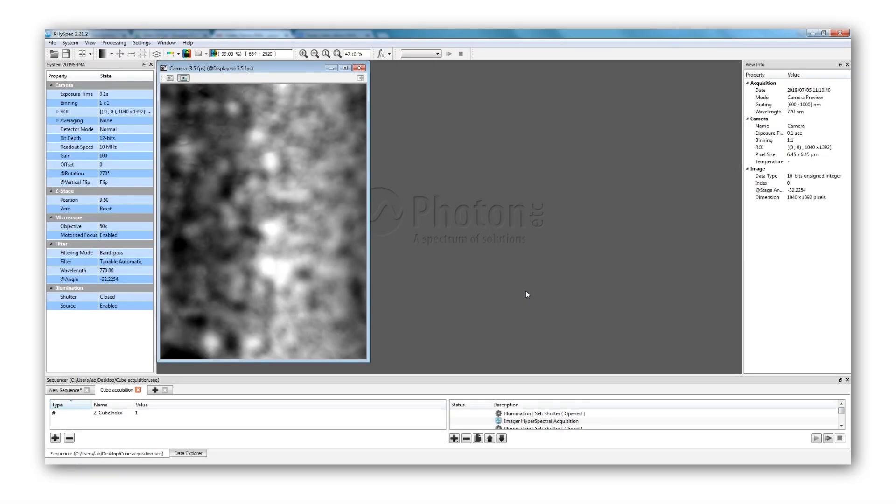Here is the FiSpec interface. On the left, you can find all the parameters of the experiment — first, the camera parameters such as exposure time, binning, and the possibility to average images. It is also possible to control the distance between the microscope and the sample, and to select the objective magnification. Finally, you can control the mode. Right now, we are in bandpass mode, or filter mode, where only a small bandwidth of wavelength is selected.